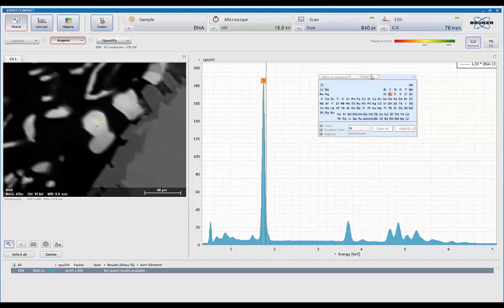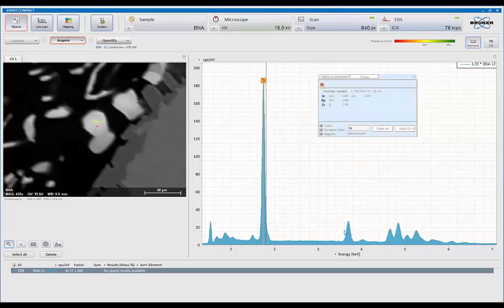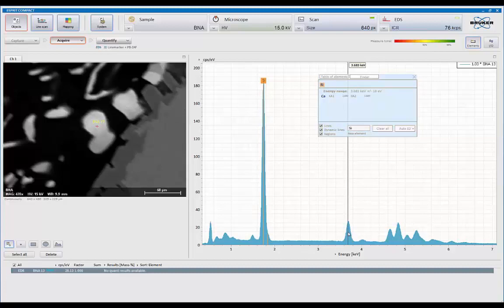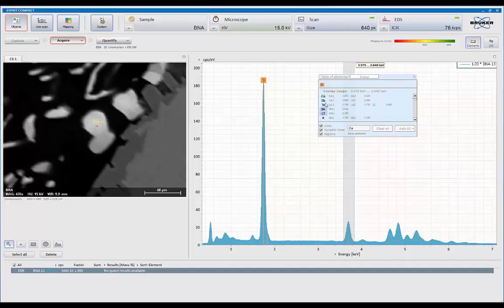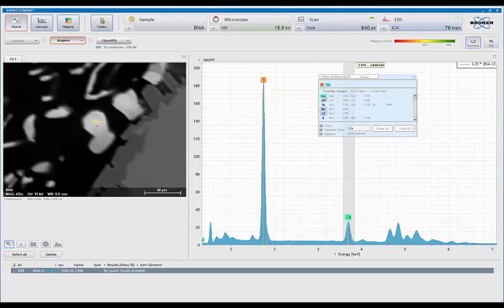You can also use Finder, which means this is a computer assist. You point to the peak or, using the right mouse button, highlight the peak, and it shows you what the possibilities are in that region. And then you can simply click on those markers and see which one fits the best. Obviously, here, calcium works out the best for this particular analysis.